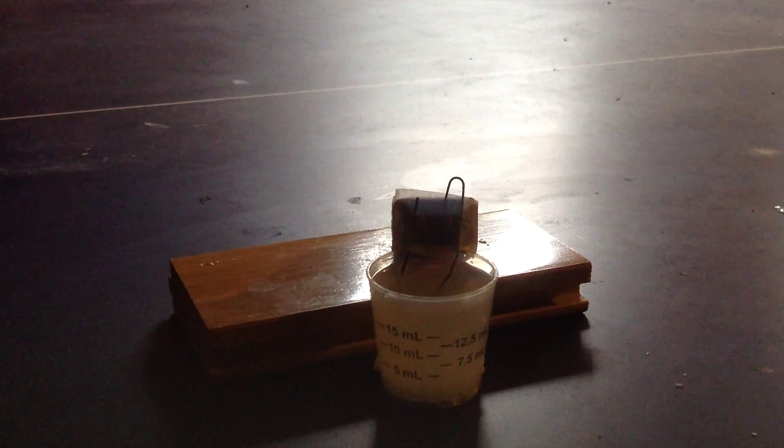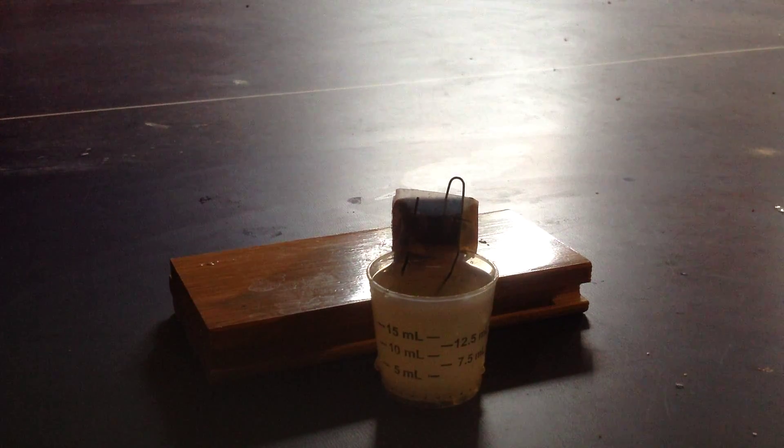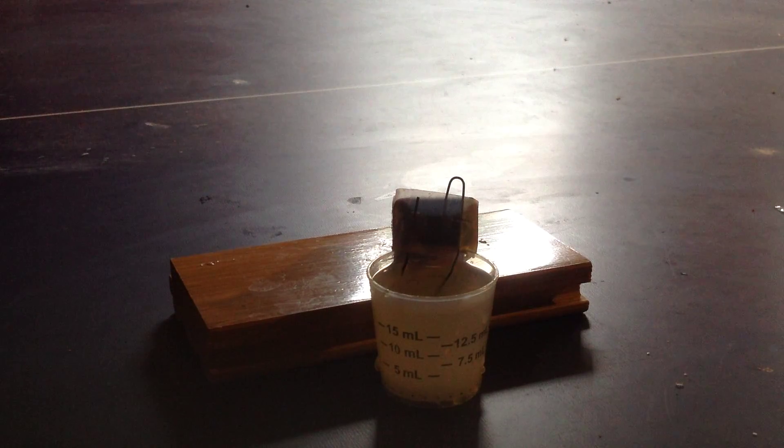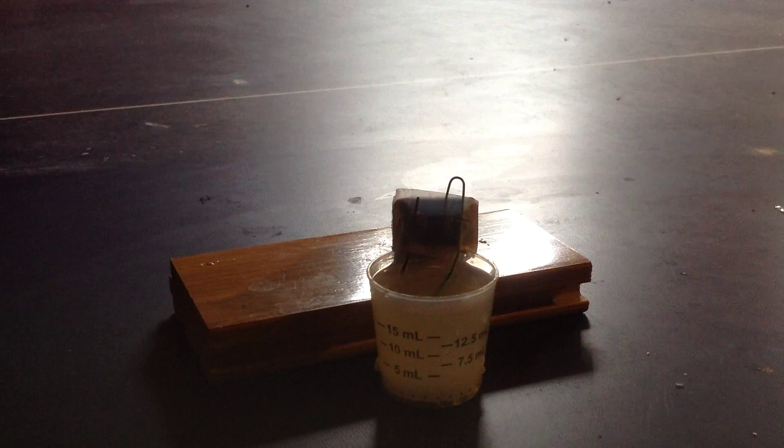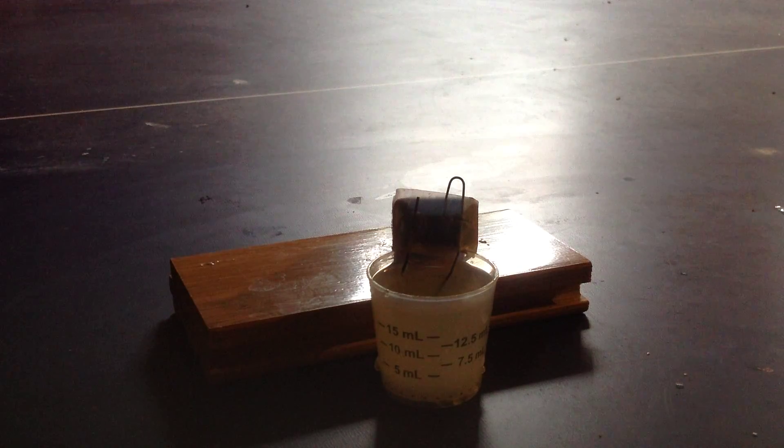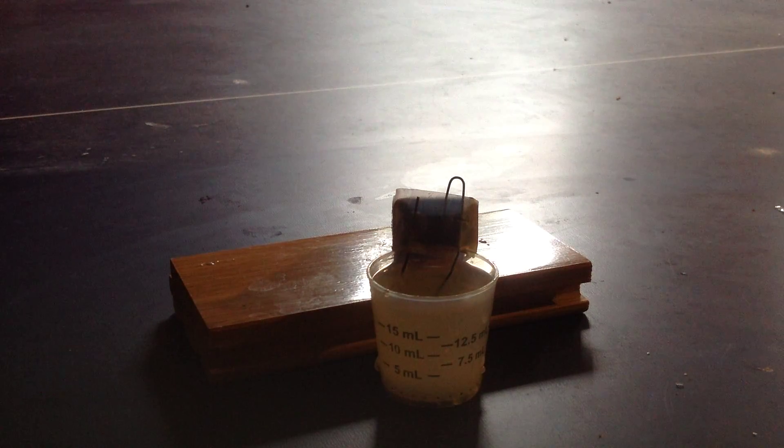So this is called the Schikorr process, not this part but the next part, but the Schikorr process is what this whole thing is based off. Iron 2 hydroxide is a greenish but you can see the solution is yellow. That's the iron chloride.